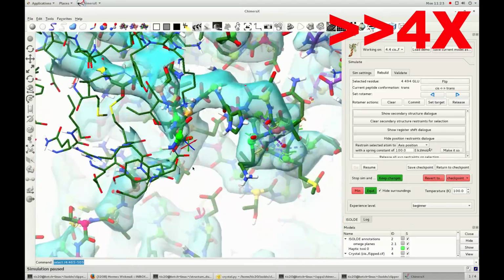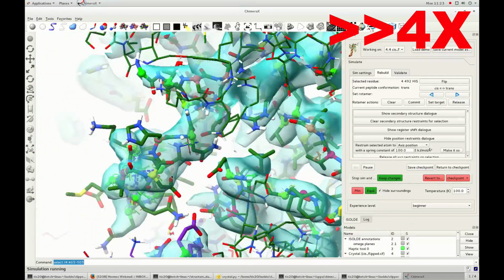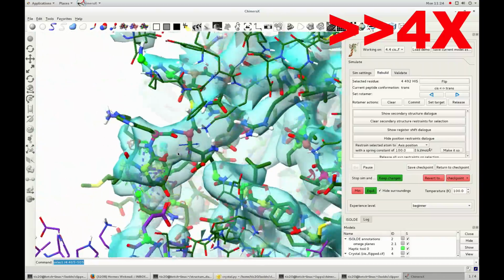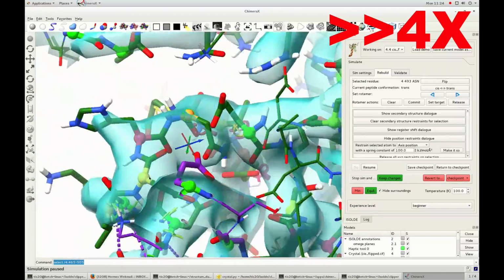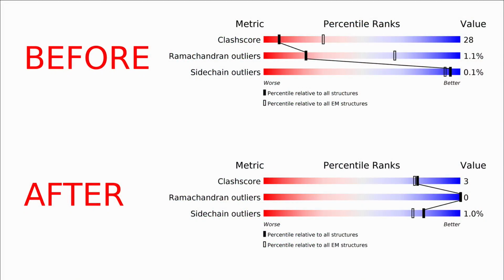The other is to once again work through systematically end to end, this time focusing on all those details that you brushed past the first time. Since this all boils down to repeated applications of the tools that I've already demonstrated, I won't bore you with it. Instead, let's jump forward to the results.